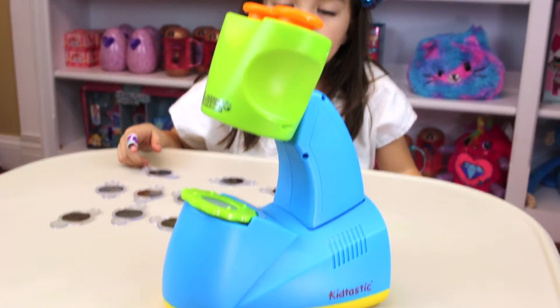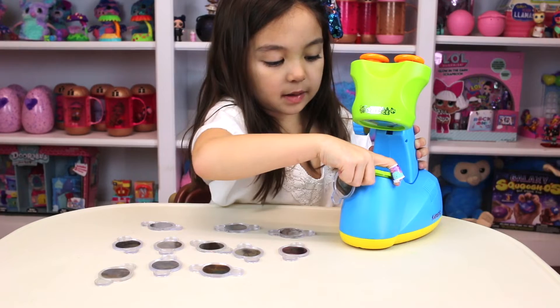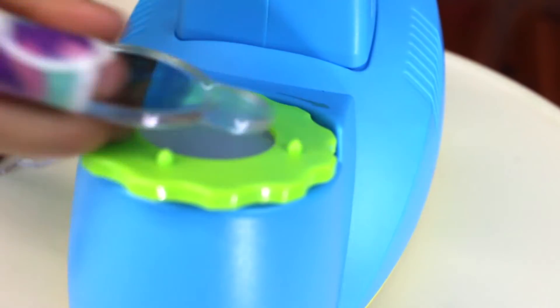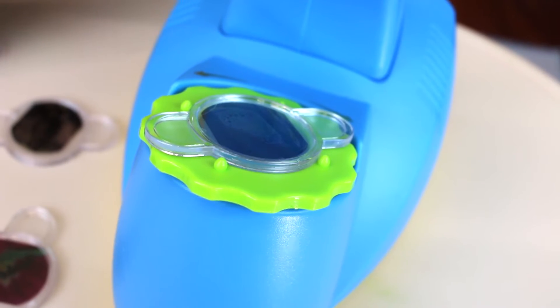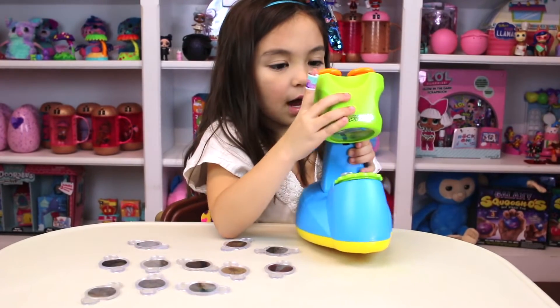So these are the different parts. I'm going to do the butterfly first. You slide the specimen in, and then it'll creep through the eyepiece.